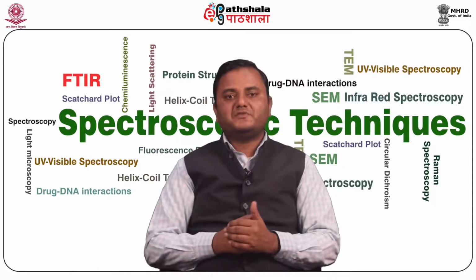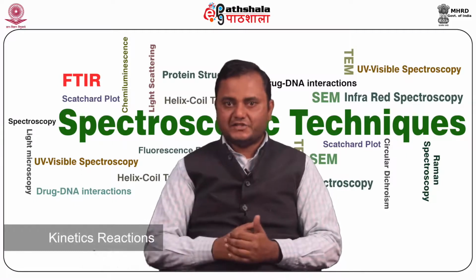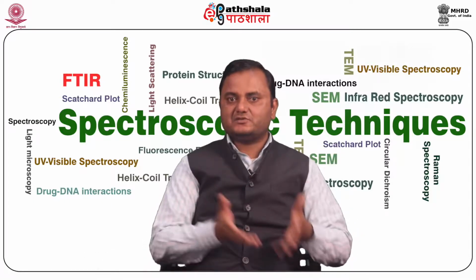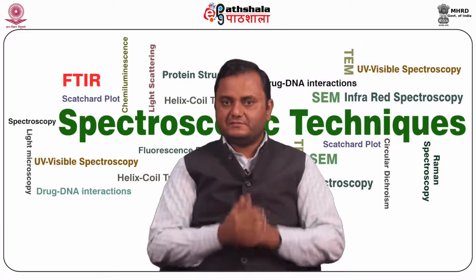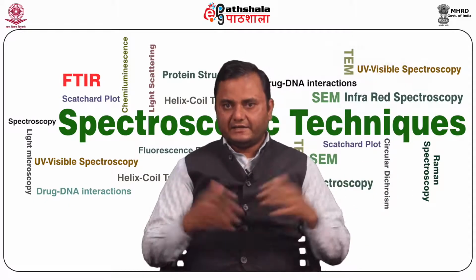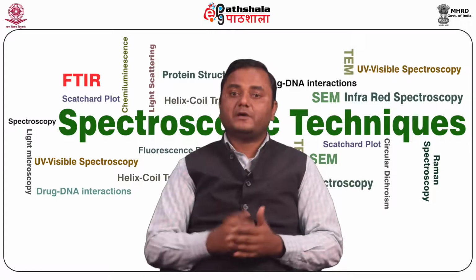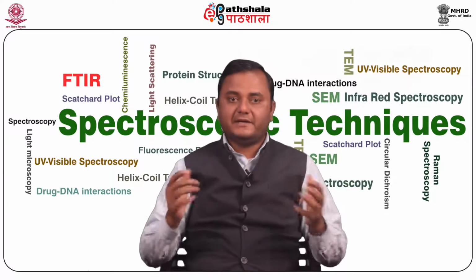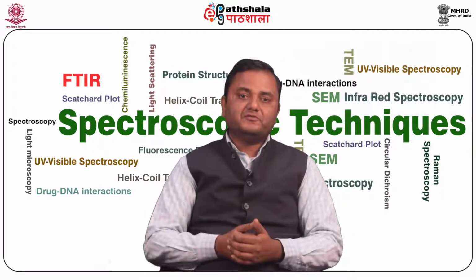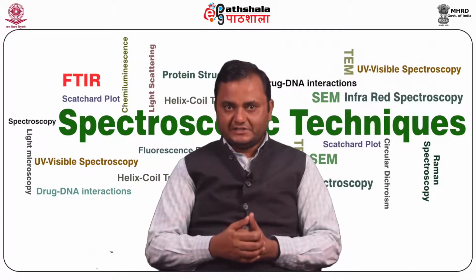It is also used for the analysis of solids, liquids and gases, and kinetics of reactions on a microsecond time scale, like the appearance of product, appearance of intermediate and disappearance of reactant at different time scales. It is also used for the analysis of chromatographic and thermogravimetric sample fractions, and for weakly absorbing samples in IR emission studies.